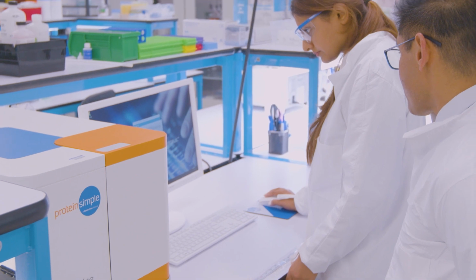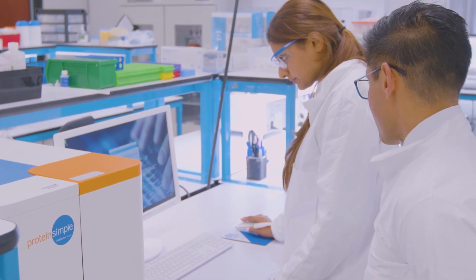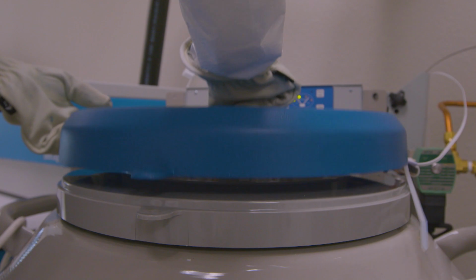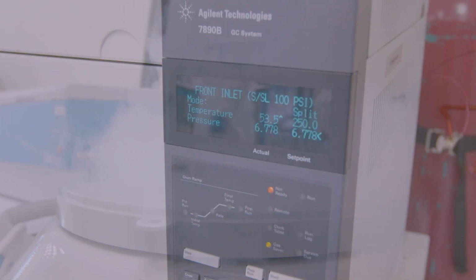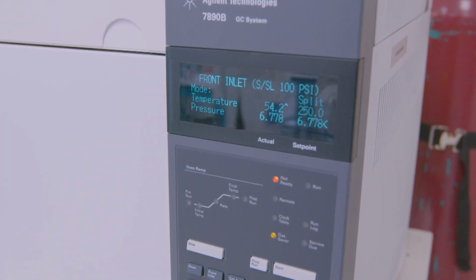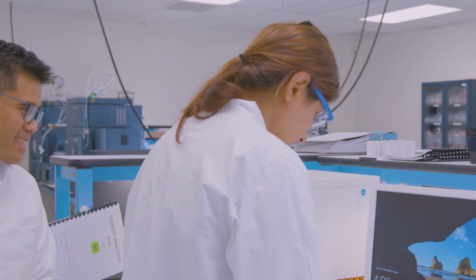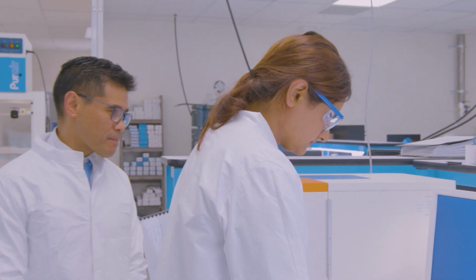The data that come out of them have to have the highest integrity, and they have to be maintained. So we have our LIMS systems and our scientific data management systems on secured servers that are backed up daily. Remember, better data is achievable when combining robustly developed methods, state-of-the-art technologies, well-maintained instrumentation, robust training programs, and commitment to data integrity.